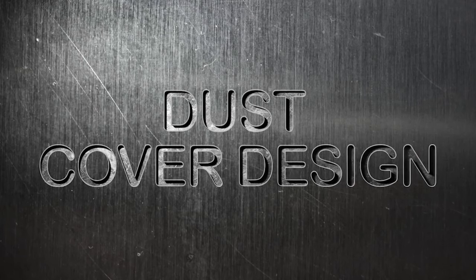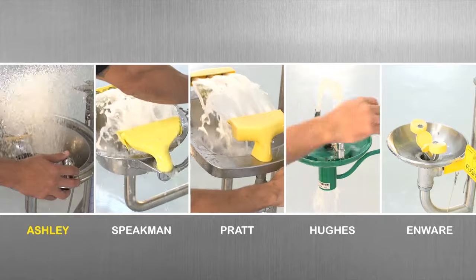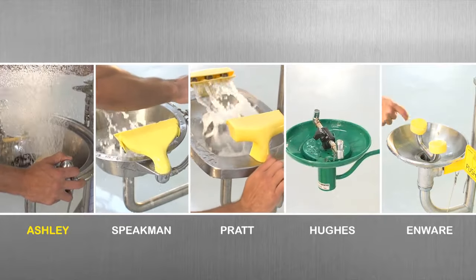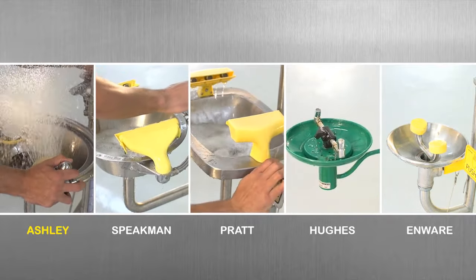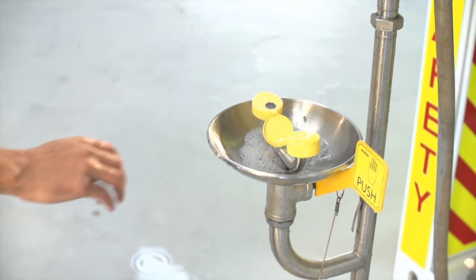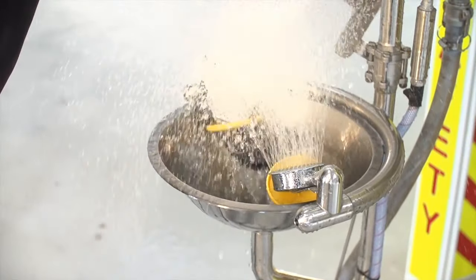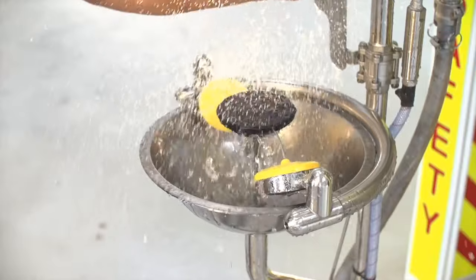Dust cover design: Dust clogging the shower jets can cause a shower not to function when it's needed most. Some designs have cheap plastic covers that repeatedly break off or fail to reset themselves after use. Ashley's have been well engineered to stand the test of time and automatically reset after each use.